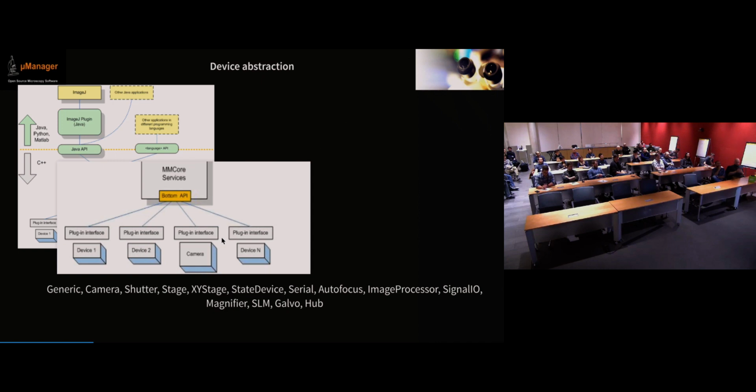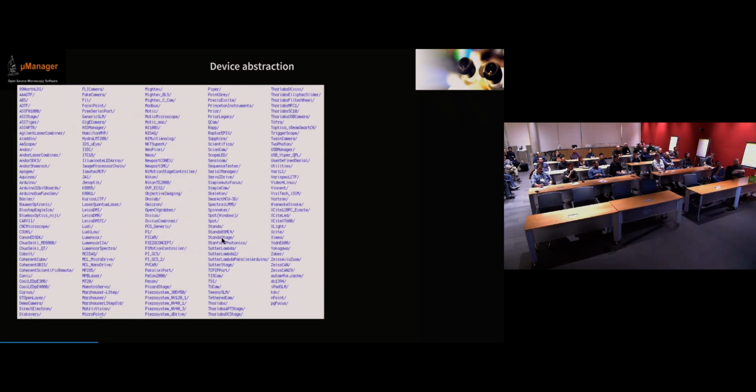If you want to write a new device adapter for a new device, you match that up with what is there, and you basically write the glue code to make that thing work. And so by making that relatively easy and straightforward, in the beginning, Nenad wrote these things, I learned how to write them, and then in no time, once Micro-Manager became slightly more widely used, we started to get contributions from academia, contributions from companies, and the list of device interfaces, device adapters is, to me, kind of stunning.